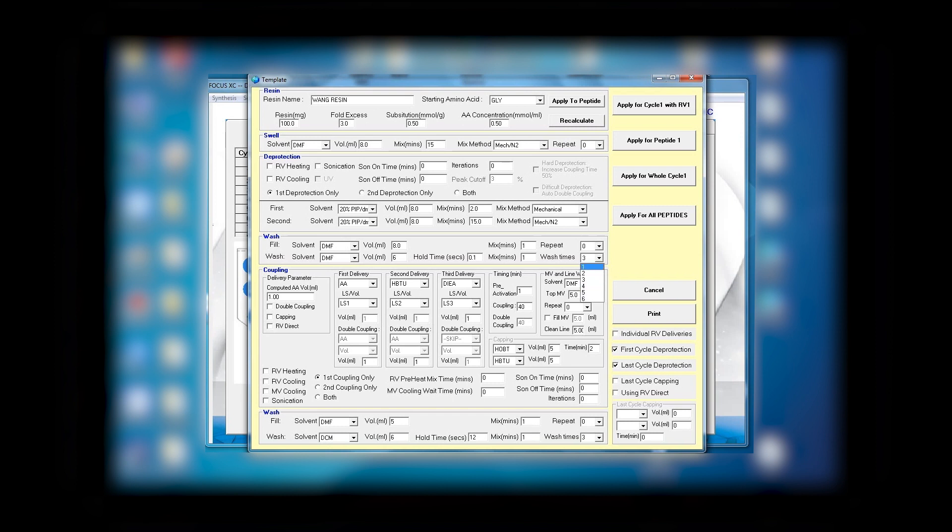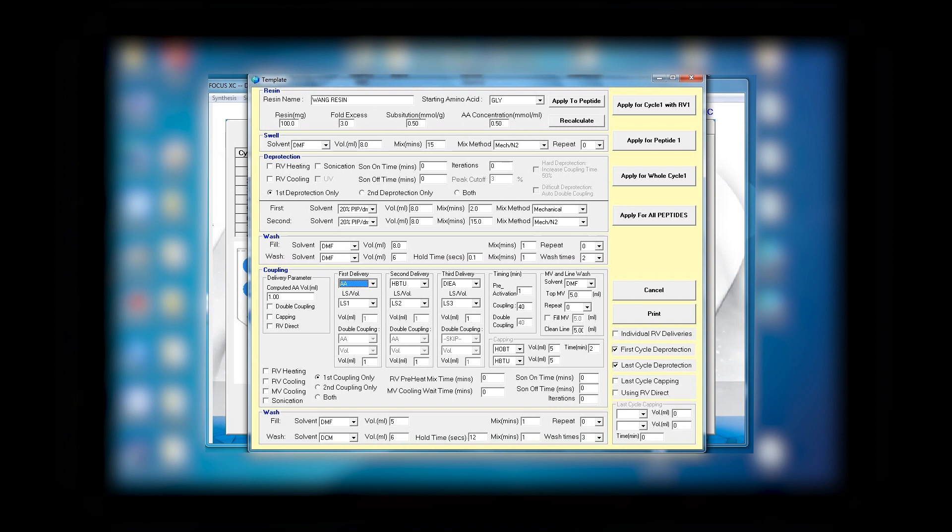Next, in the coupling section, the amino acid can be determined by volume or precisely with the liquid sensor LS1. The LS1 measuring vessel using the photo cells allows you to measure exactly what you want. You can put LS1, the liquid sensor, to three milliliter, five milliliter, or whatever you would like.